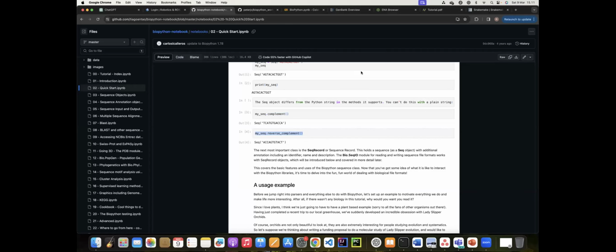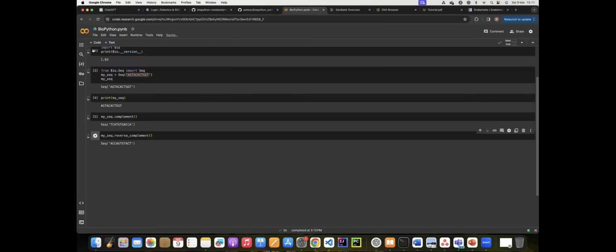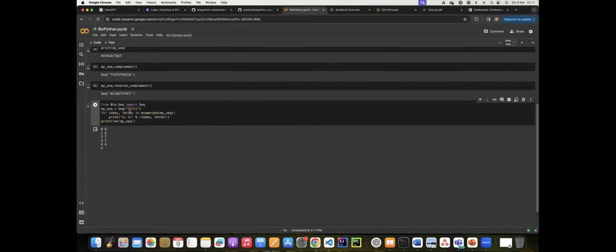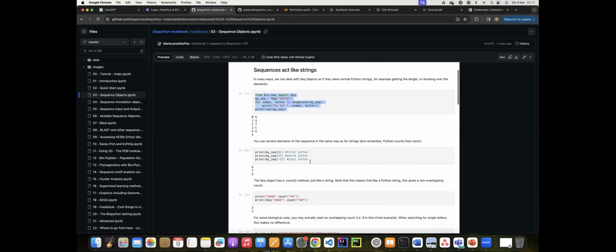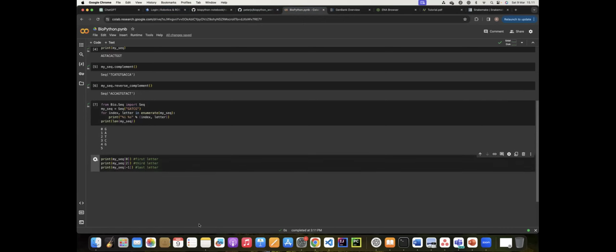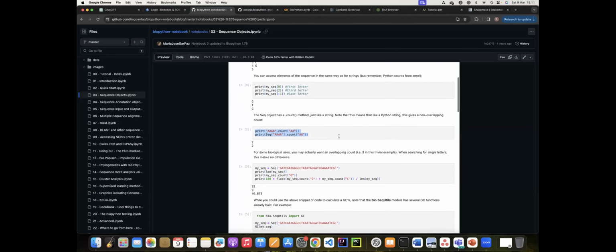Okay, so spend your time in this tutorial for the basics, but make sure that you can also use ChatGPT to memorize, instead of you having to memorize the code or the library. Yeah. So the best way to learn this kind of library is to familiarize yourself with the features and then to automate code generation using ChatGPT.